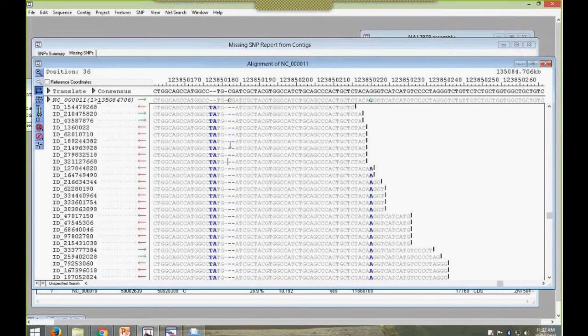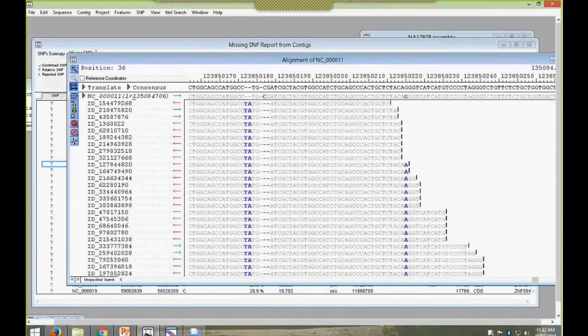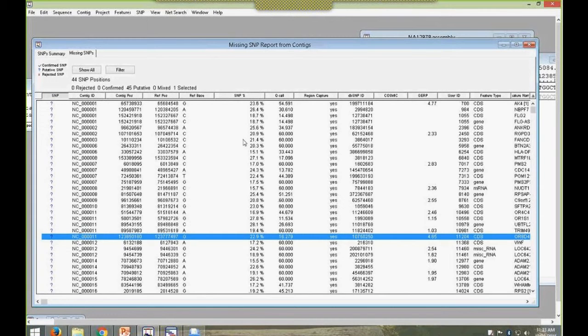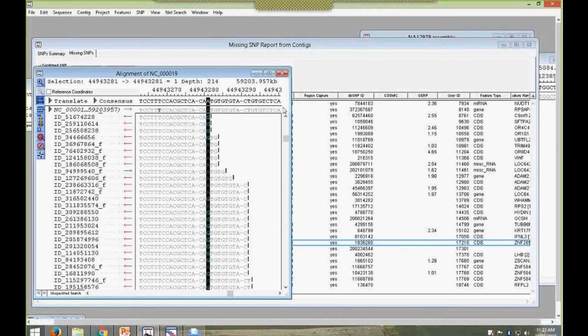So we can look at these areas and say, well, we could improve the alignment. Maybe we can't. Maybe that's what it is, or maybe the SNP really should have been next door, and we go back to the database and say, well, we think the SNP actually is one base pair left or right of where it was listed in the database. So again, it's only 44, but it is worth looking at them just to get a feel for what's getting missed.